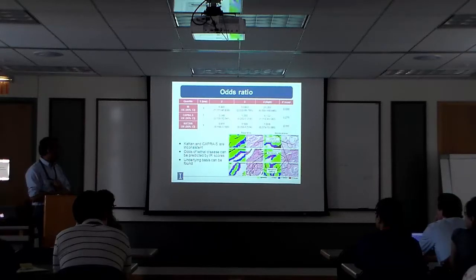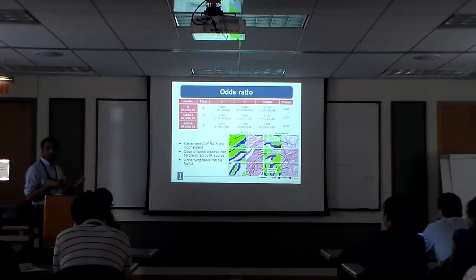So this is the clinical gold standard 1, and 2, this comes from the East Coast, this is the West Coast, so it's like rap, it's competing schools of thought, right? But neither one of them gives you a very good prediction, right? What we can do is not only give you a linearly changing prediction, but also a 20-fold compared to 1.